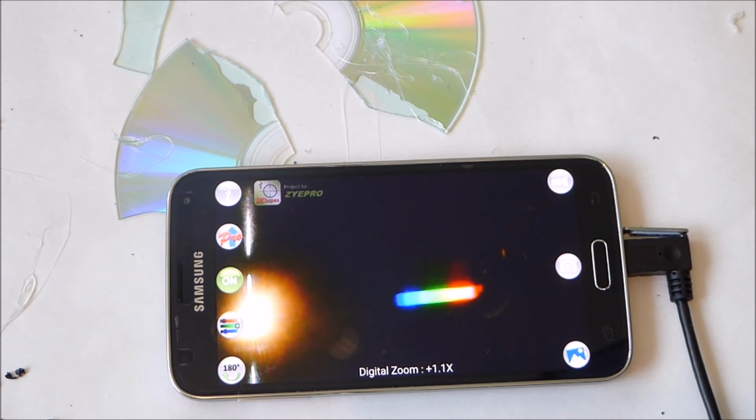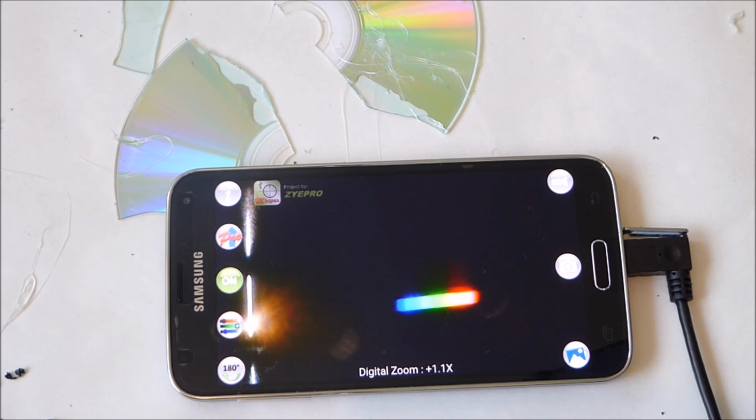So now we need to run some samples. If I burn the flame, take a sample photo with just lead oxide or lead burning in that flame, and then compare it to a sample of, say, a knockoff toy being burnt in the same flame, we should be able to work out whether there's lead in there or not.